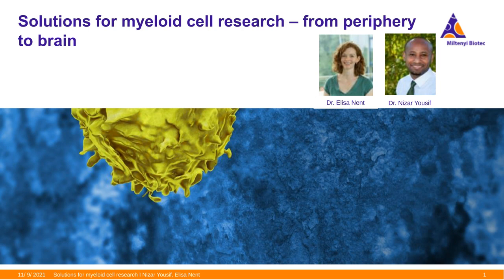Thank you. Next question. How is the MACSQuant Tyto cell sorter used for the analysis of PSC-derived microglia? This was also something that I didn't go into much detail. Basically, the Tyto was used in this case to sort the microglia, especially before transplantation.